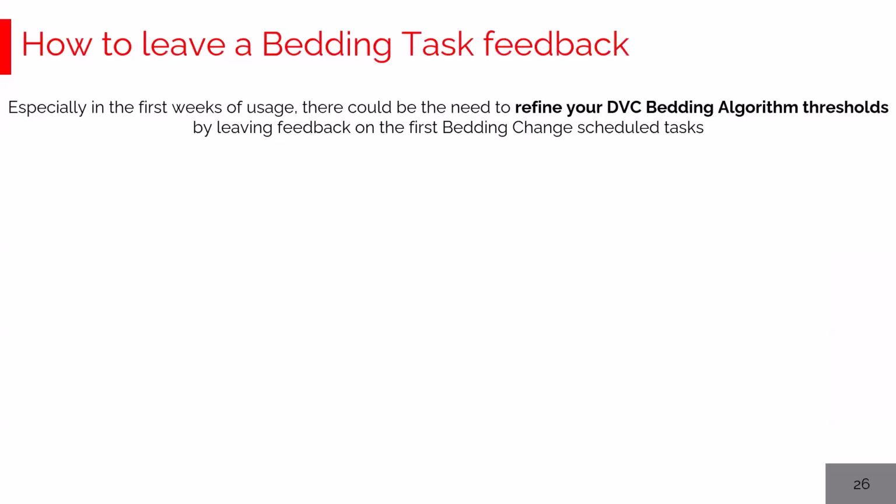Last but not least, especially for the users who are starting running and playing with the DVC, I would like to show you how to refine your DVC bedding algorithm thresholds by leaving feedback on the first bedding changes scheduled by the DVC. This is strategically very, very important to achieve.